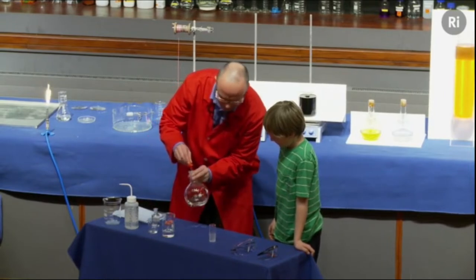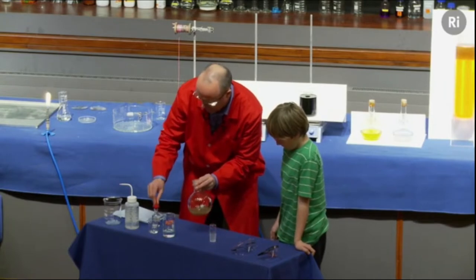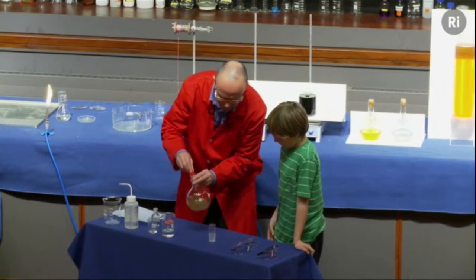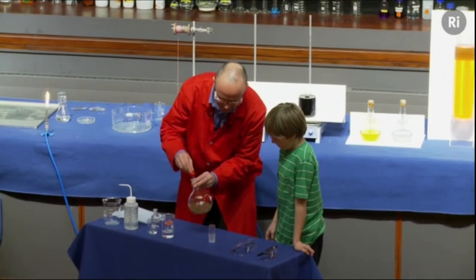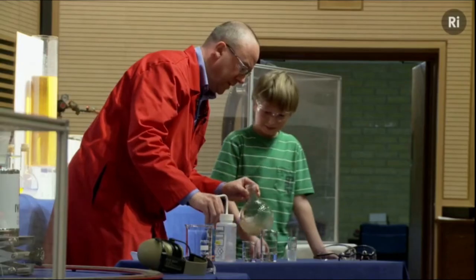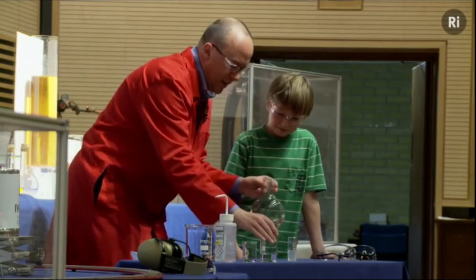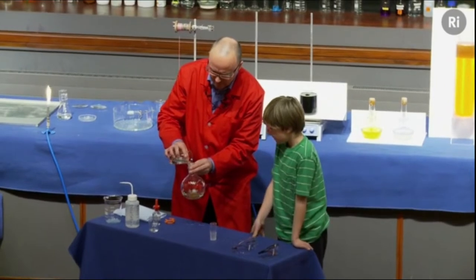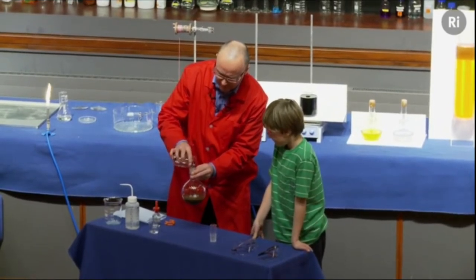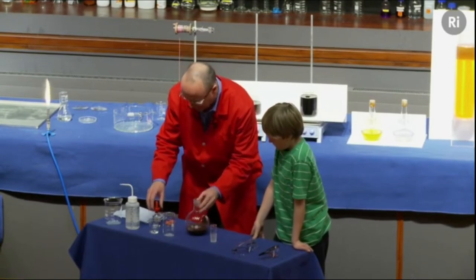Now, when I add the ammonia, can you see that it's forming a sort of brown colour? I'm going to keep on adding the ammonia, and in a minute, that brown colour should disappear. There, that's disappeared, isn't it? Now what I'm going to do is to add some sodium hydroxide. That's now formed a sort of very dark brown, almost a black material.